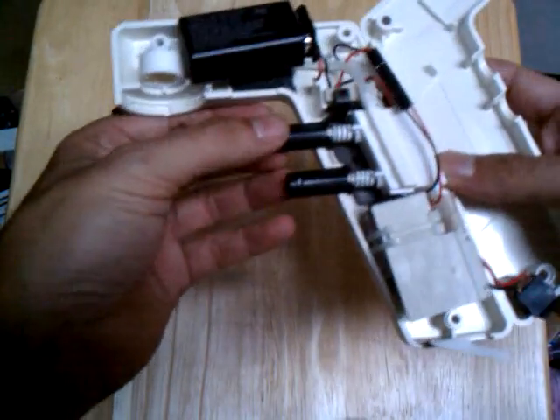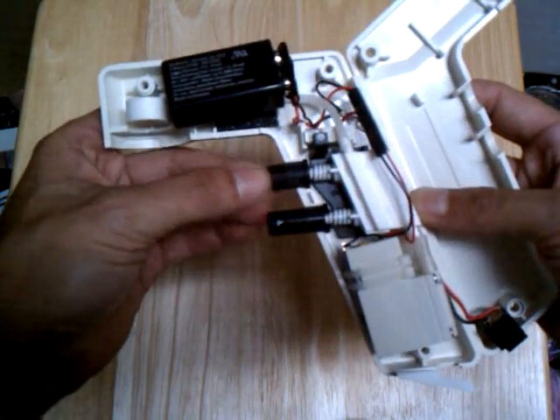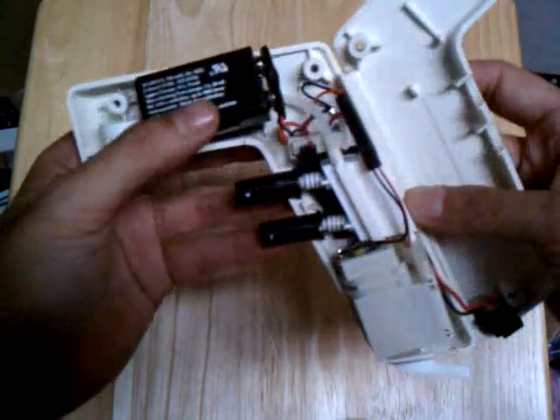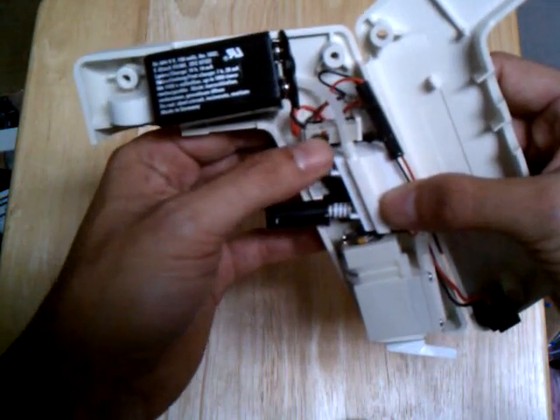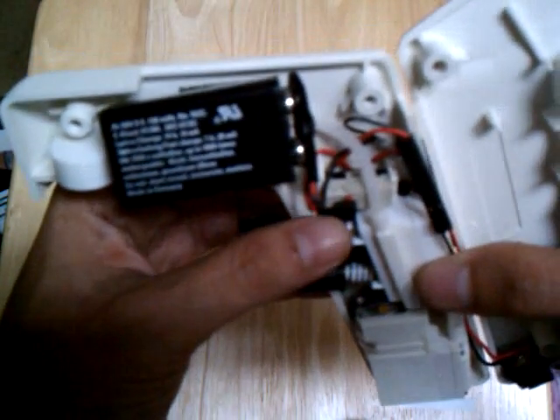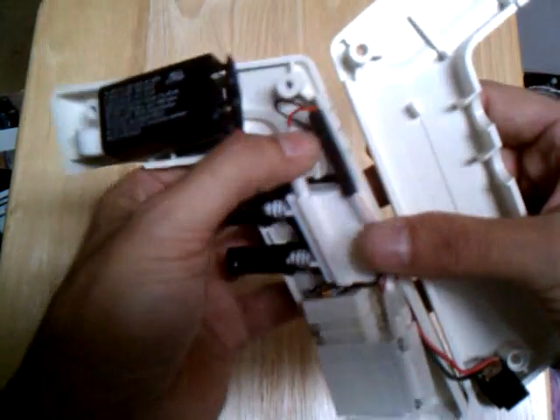These, I believe, are potentiometers — you can turn them, slow them down, speed them up. There's a little micro switch there, very cool. And some assorted connectors.